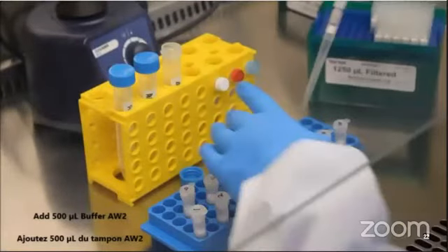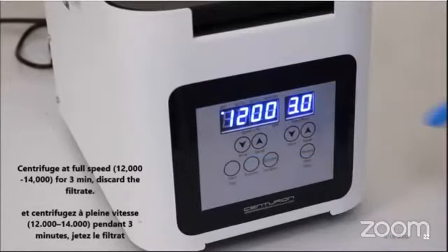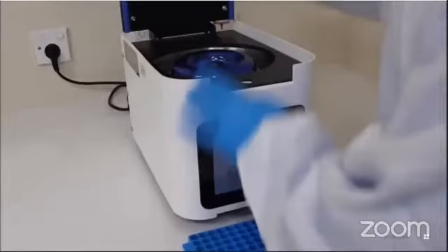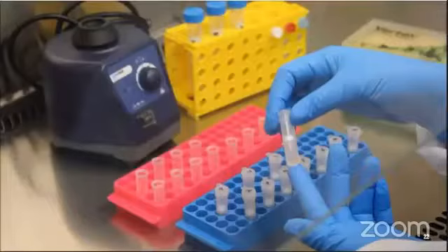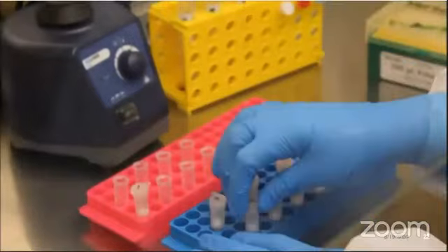After addition of the AW2, centrifuge at full speed for 3 minutes. This high-speed centrifugation removes all the remaining particles from the column. Now place the column into a new collection tube. This is basically an optional step.